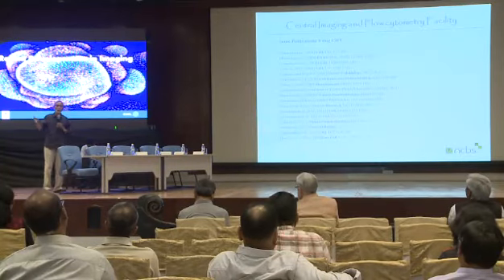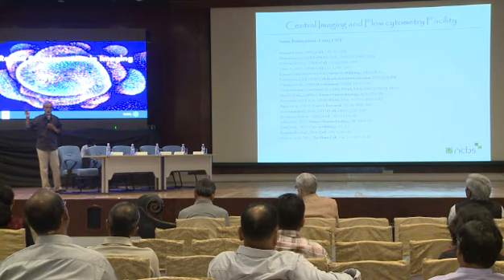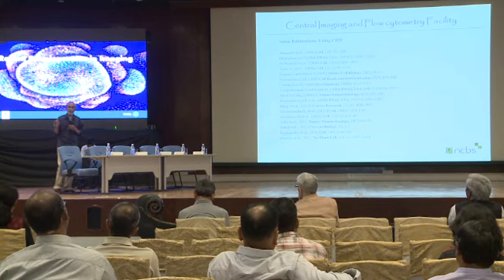The second one, we developed an Indian company to develop a CD4, CD8 kit, which was not available in the market at that time, indigenously developed. It's a Bangalore-based company that has been in the market since then, and the test has come down to 250 rupees, which used to be 1,000 plus. The third achievement of our facility is we help the plant biologists, the plant breeders especially, the seed companies, to find double haploids easily. I asked them, where were you doing it before coming to NCBS? They said they were sending it to Netherlands. I don't know why. It was so easy.